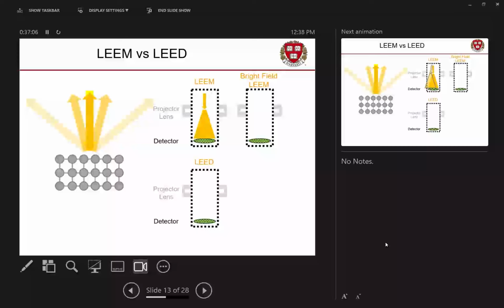They go through the optics the same way, which means that not only do we get our main beam that gives our LEEM images, we also get those diffracted beams. They get magnified up the same way through the optics. And that means we get several different images slightly offset from each other projected onto the detector and makes everything blurry. Kind of like this.